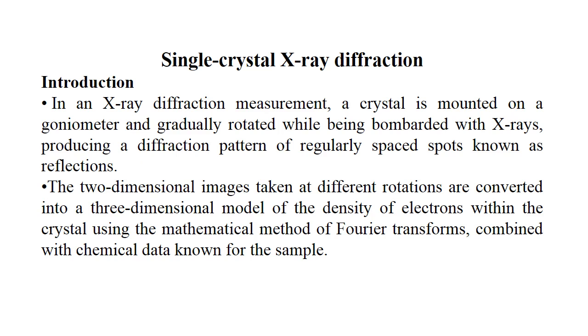Single crystal X-ray diffraction. What is single crystal X-ray diffraction? We are going to discuss the introduction. In an X-ray diffraction measurement, a crystal is mounted on a goniometer and gradually rotated while being bombarded with X-rays, producing a diffraction pattern of regularly spaced spots known as reflections.